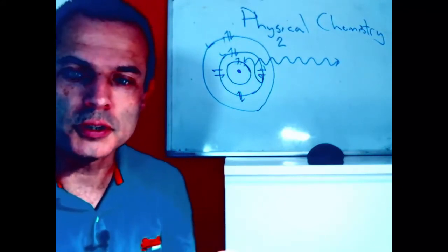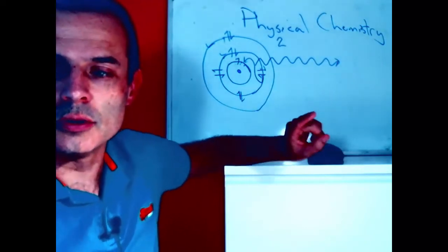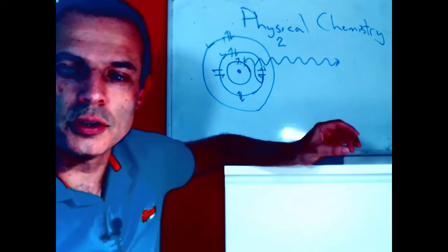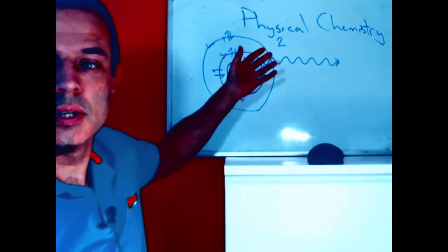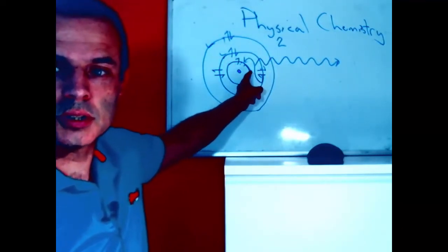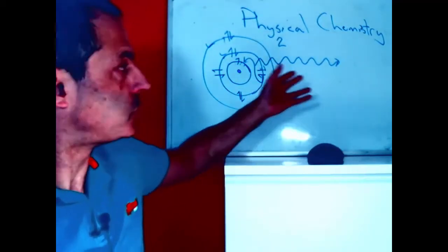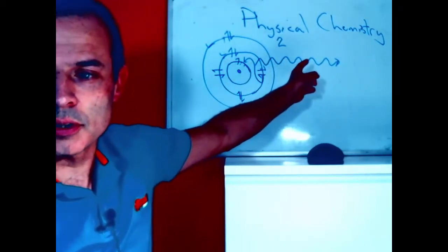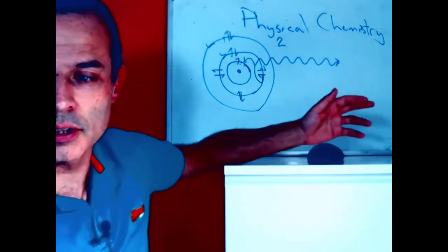There is a second advantage of this same technique, which is that the X-ray coming out is not charged and has no information on the energy of the thing that we put in to start with. So it doesn't matter what energy we put in, we get the same X-ray out because it's just the difference in energy between these two internal levels. That means that if our sample charges up, because we've shot electrons out, it doesn't change the energy of this X-ray, whereas if we had an electron coming out, it would hold it back or accelerate it.